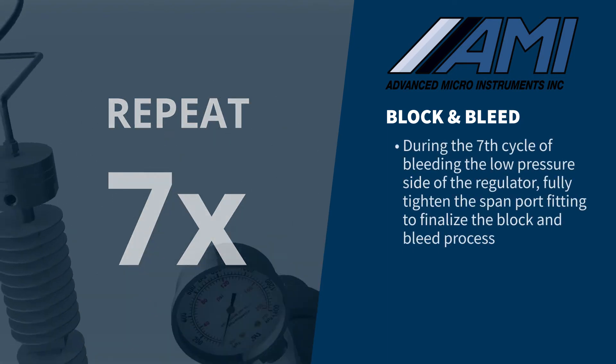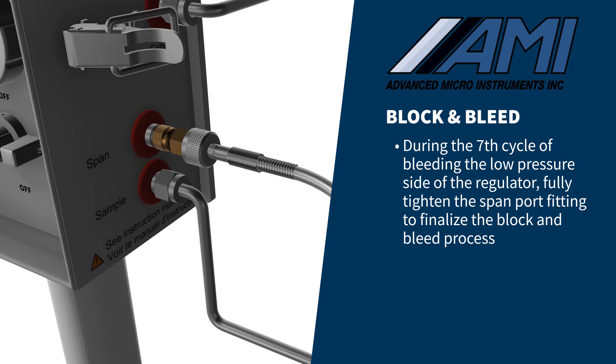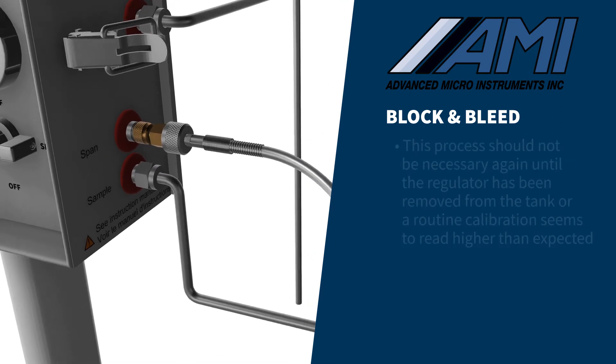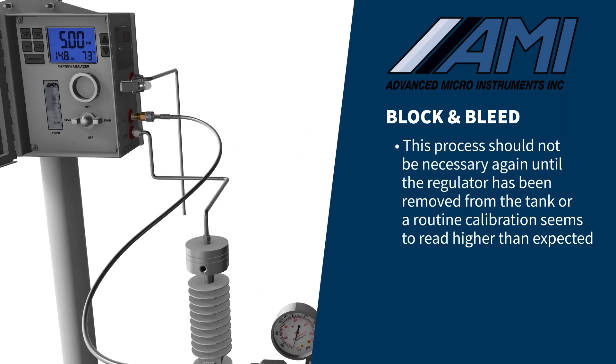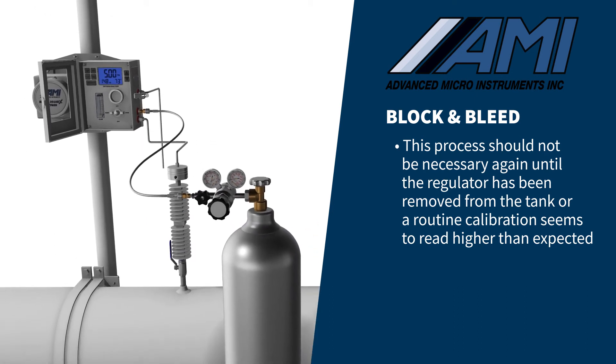During the seventh cycle of bleeding of the low-pressure side of the regulator, fully tighten the span port fitting to finalize the block and bleed process. Performing the block and bleed process should not be necessary again until the regulator has been removed from the tank, or a routine calibration seems to read higher than expected.